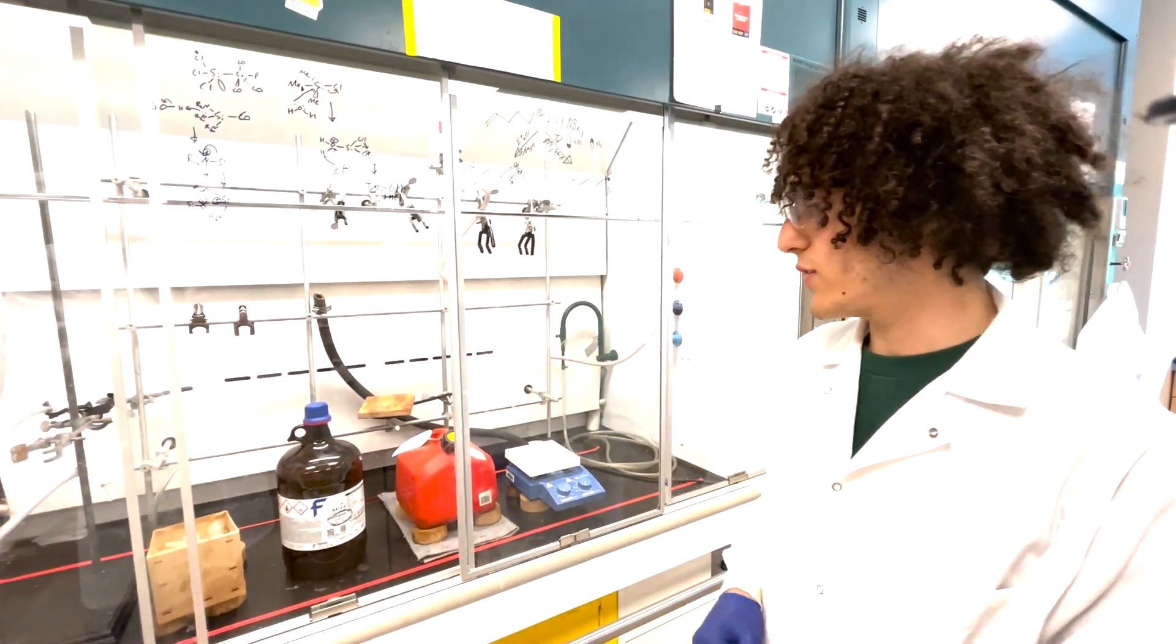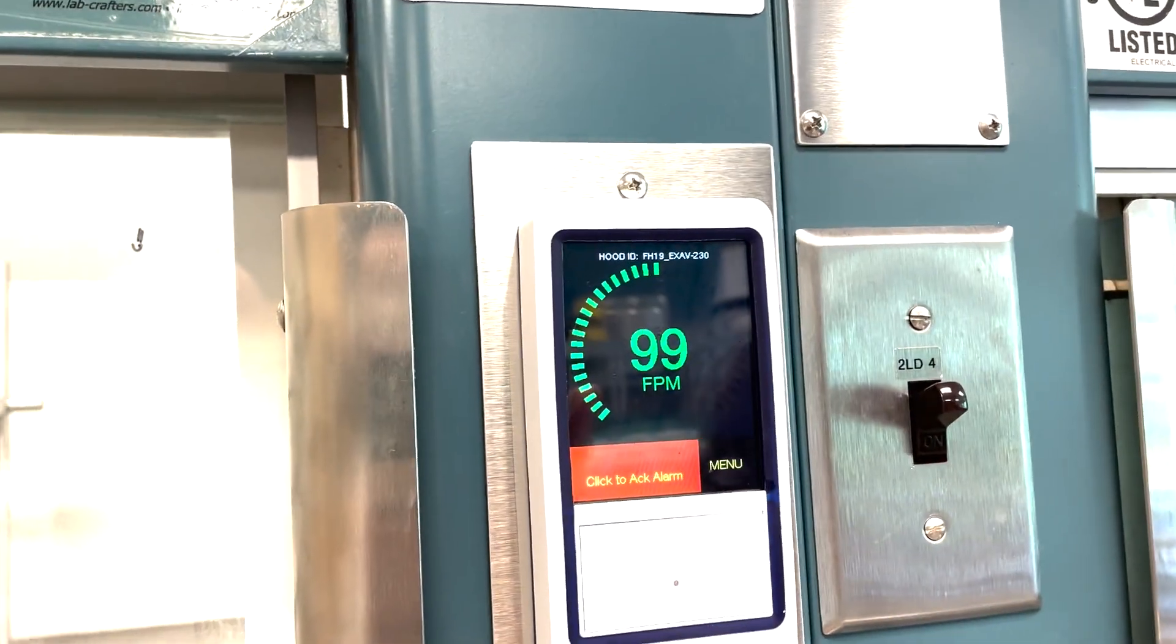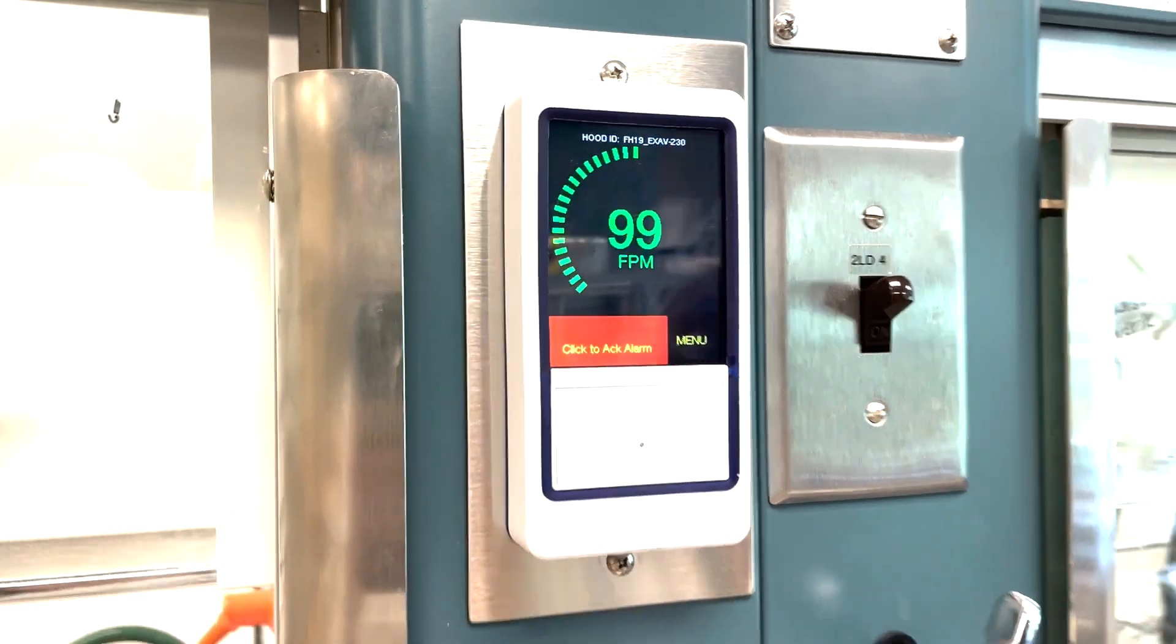In more modern fume hoods such as here in Vogue Wright, we get digital readouts which have the face velocity shown in fpm or feet per minute.